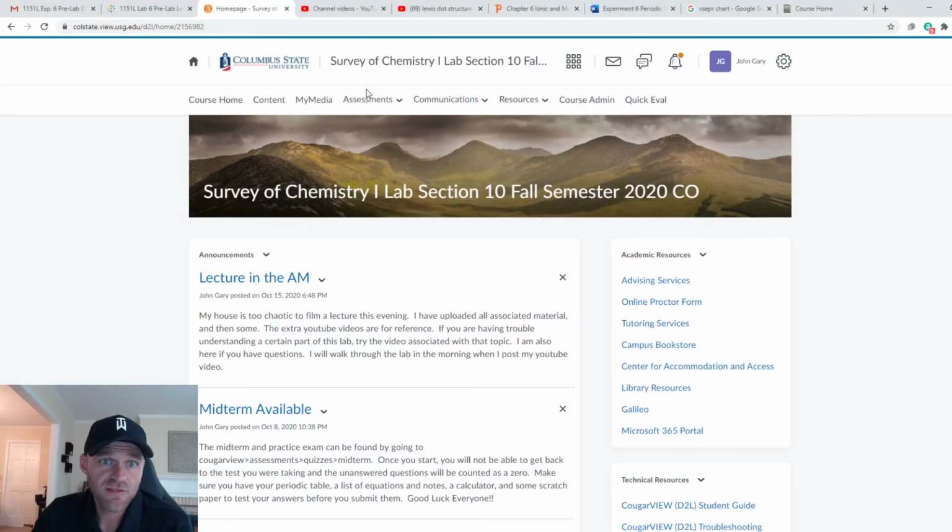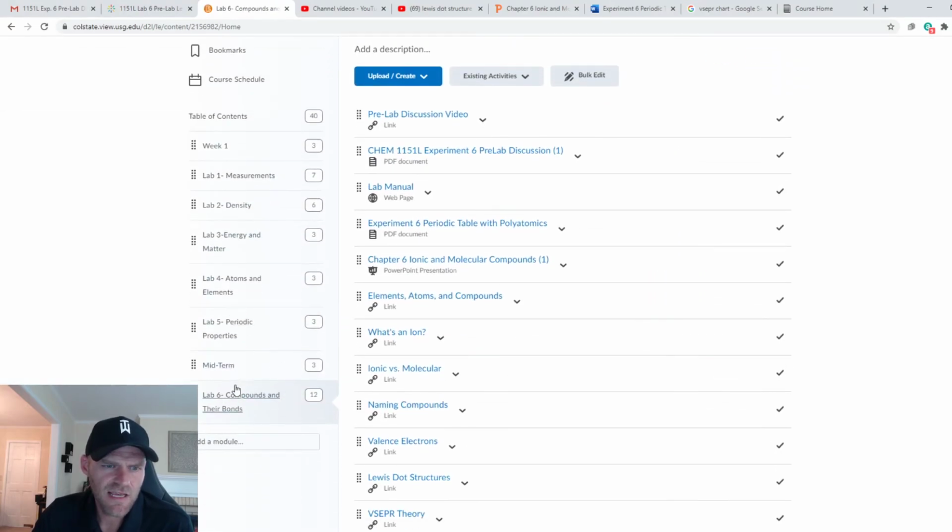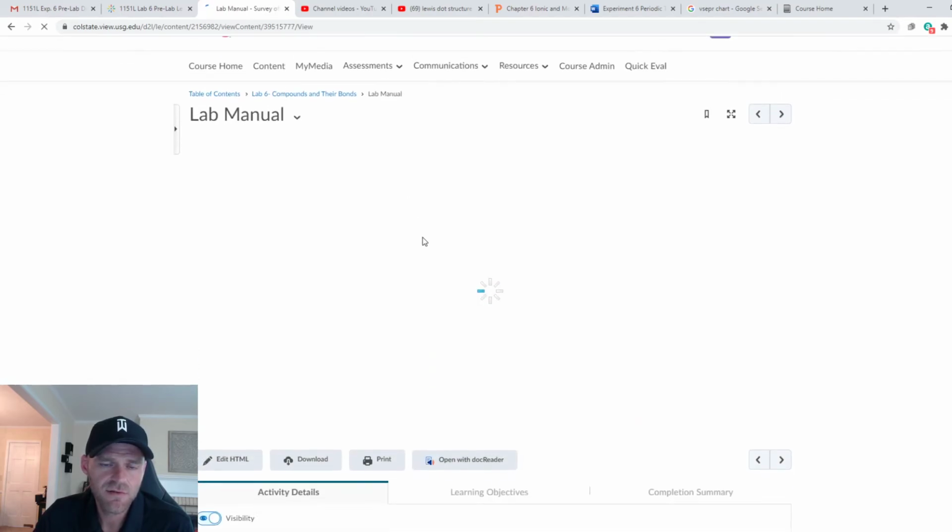Okay, so let's look at the lab manual and see what we've got to do today. So where was it? Internet. I posted the lab manual under content for lab 6, Compounds and Their Bonds, lab manual.